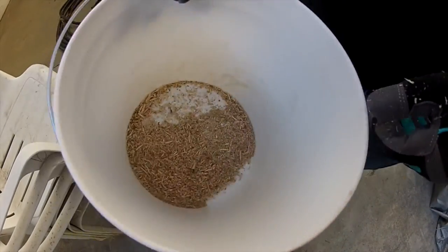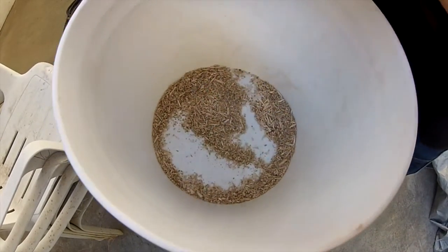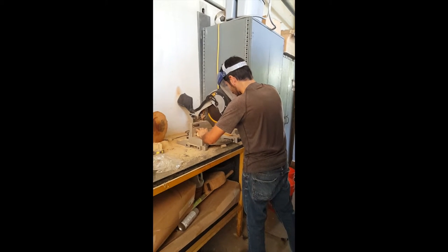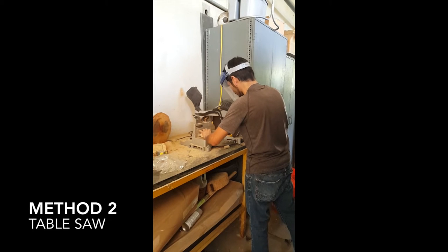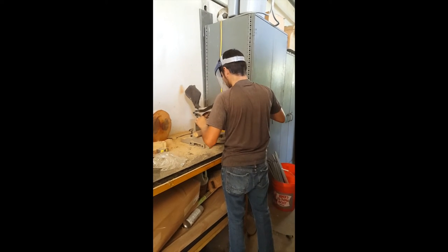This is an acceptable sawdust consistency for the rearing diet. Finer sawdust is also acceptable. An alternative method that we use to make sawdust is a table saw. This method produces finer sawdust than the Wiley mill, which makes for a more homogeneous diet mixture.